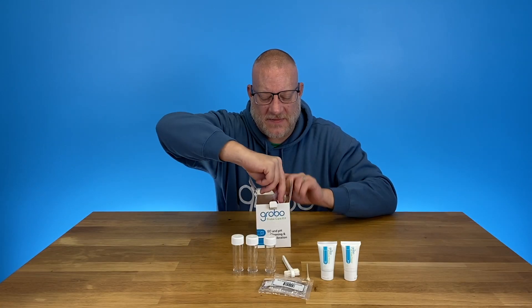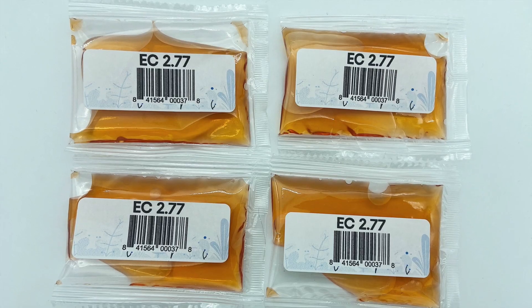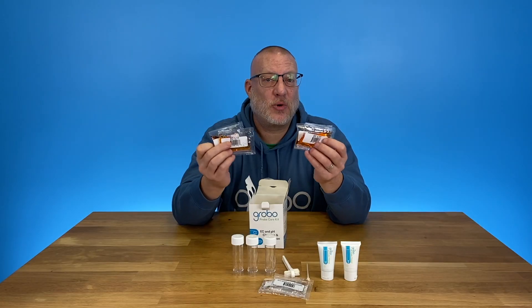Next we have our EC calibration solution of 2.77. When we calibrate the EC probe, we calibrate it dry and to 2.77.